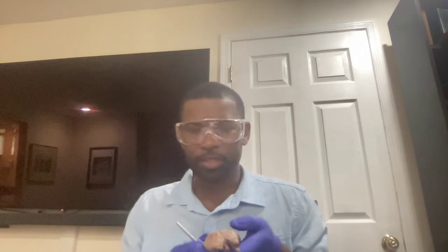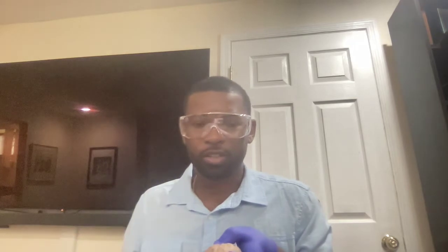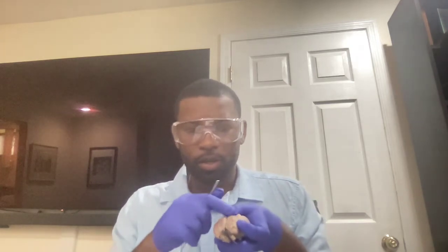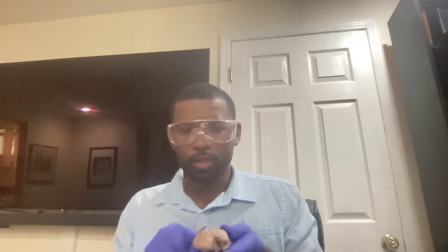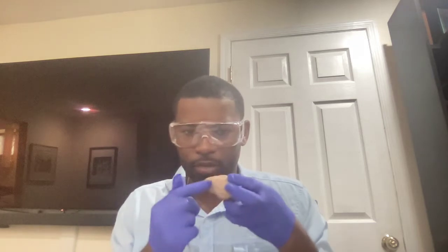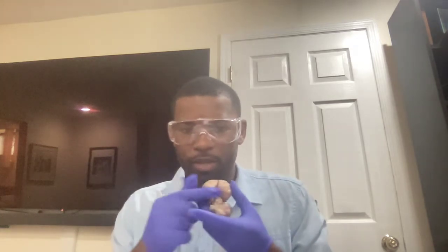The next thing I'm going to go over is the different lobes of the brain. Right here, as you can see, we have the frontal lobes. The frontal lobes are important for executive functioning, such as thinking, problem solving, creativity. Then posterior to that, we have the parietal lobes right here. Then right here we have the temporal lobes, which is important for our auditory functions. Then we have the occipital lobe, which is important for our vision.